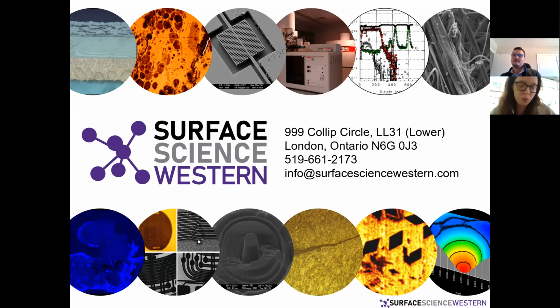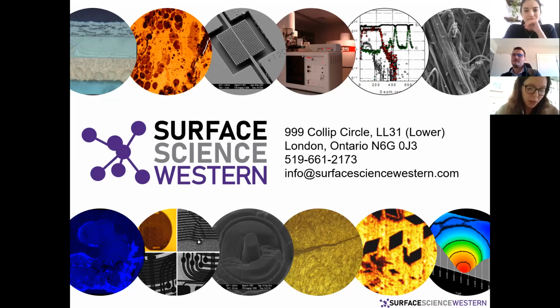If no one else starts, I will start with one from Professor Marc-André. He asked: rare earths are often a nightmare to analyze due to multiple unpaired electrons. Are there guidelines for constraining the width of electron bands in the complex rare earth peaks? The rare earths, yeah, there's a whole other level of complexity, and the big problem with the rare earths is there hasn't been a lot of work done on them.